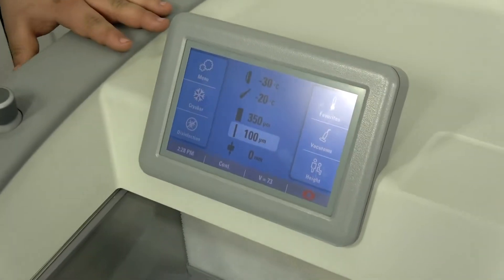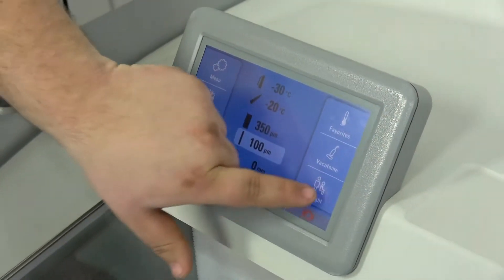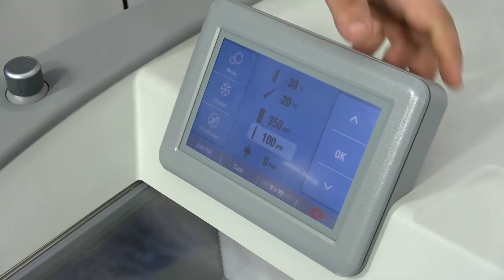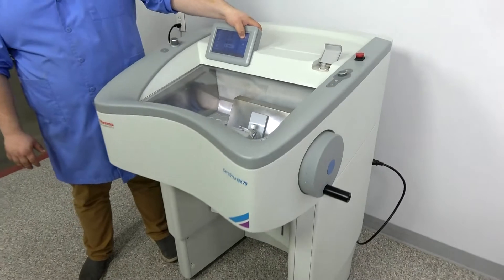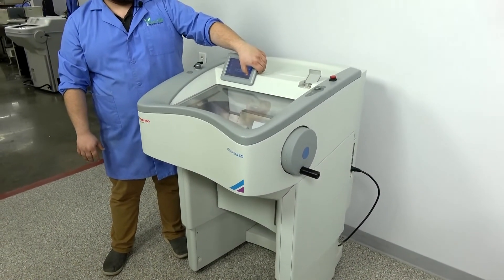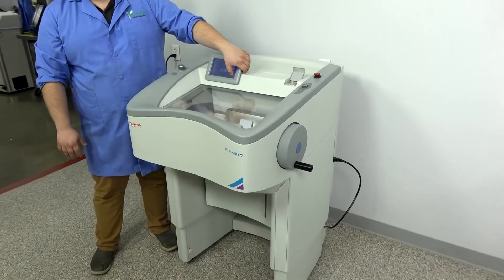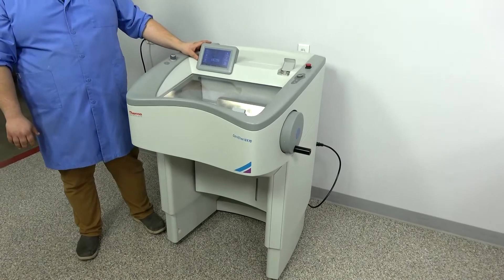The last and coolest feature of this microtome, this cryostat, is your height feature. This allows you to move the whole cryostat up and down depending on the height of your lab technicians.